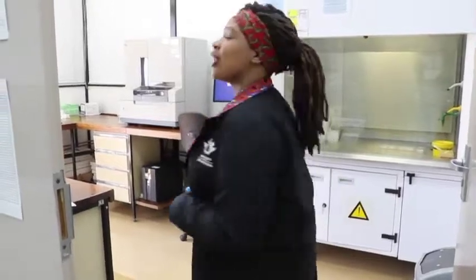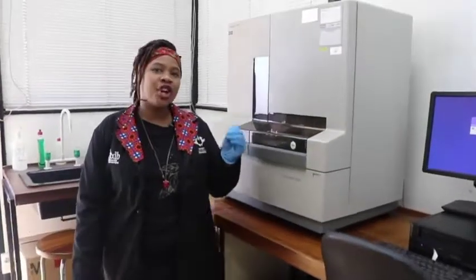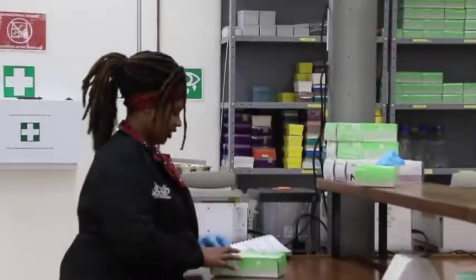Last but not least, this is our sequencing room where we take our samples once they've been PCR-processed and visualised. We bring them to this big machine called the sequencer. What this does is turn the actual material DNA into digital DNA containing the four bases A, T, G and C. So what we basically do in this lab is turn actual DNA into digital DNA, which we can analyse and compare to what is out there.